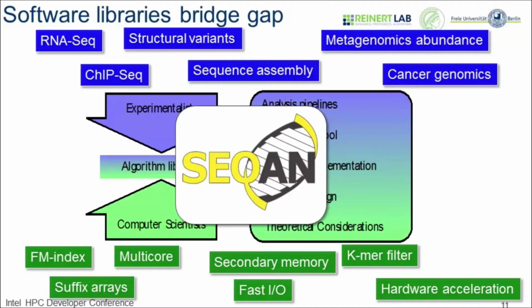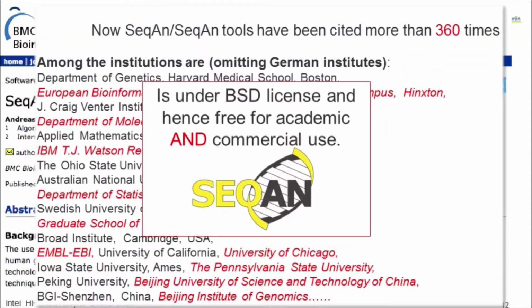We have now a technology which allows us to acquire 10^14, 10^15 base pairs. And people are doing that, right? Iceland has sequenced the whole population. Saudi Arabia started a project. England will do a 100,000 genome project. So many, many more people will get sequenced. And so we have to deal with analyzing this data.